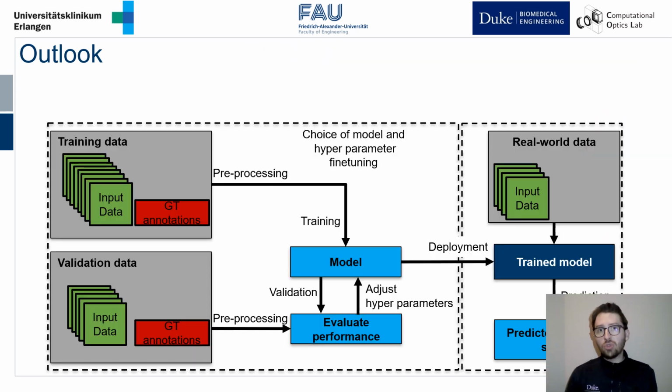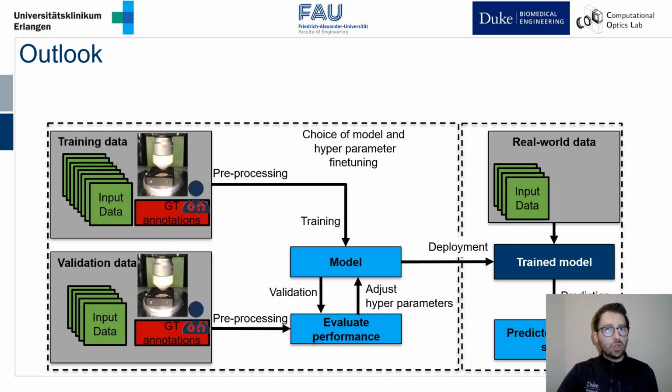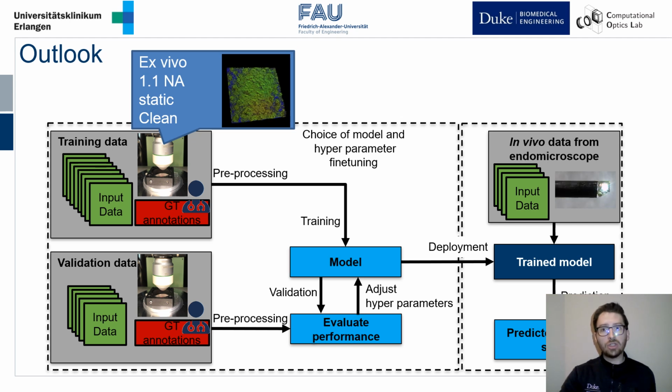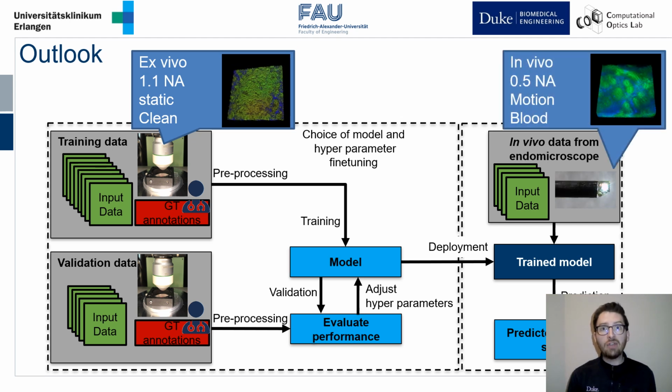Where this approach would really be interesting is if we could train a model on the high quality ex vivo data, where we have full control, a controlled environment, high resolution, no motion artifacts, and a static clean environment, and we can just generate a bunch of data and train a really powerful model. But the biggest step would then be to apply and deploy this model to the in vivo data of lower quality but much more clinical relevance.